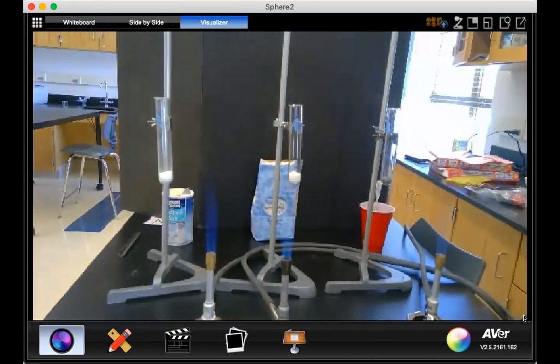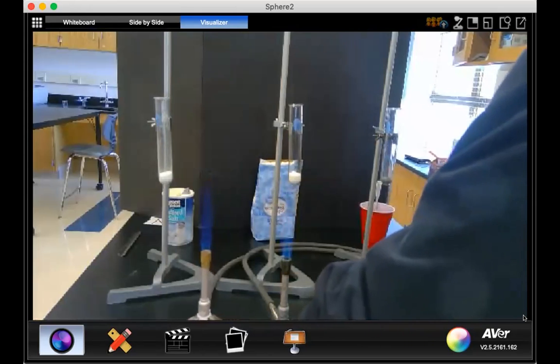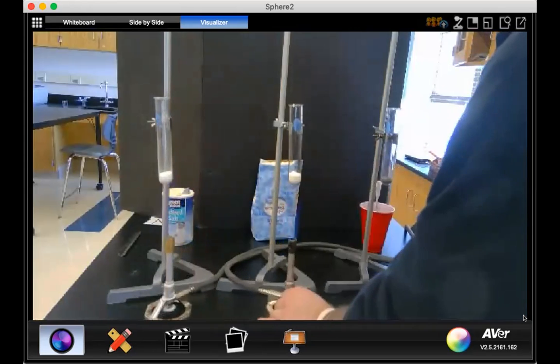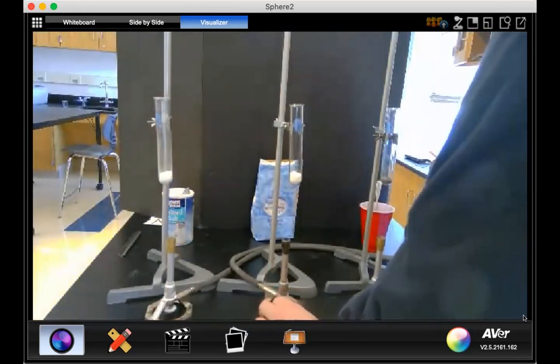So I got my Bunsen burners going. Again, they all have a pretty similar size flame in order that we can keep a fairly consistent test. And what I want to do is I'm going to need to time this. I'm going to set a little timer, so that for every minute that they are running, we can make our observations and record them on our data table. So I'm going to slide my Bunsen burners underneath each of these. And we'll start cooking them and see what kind of results we get.